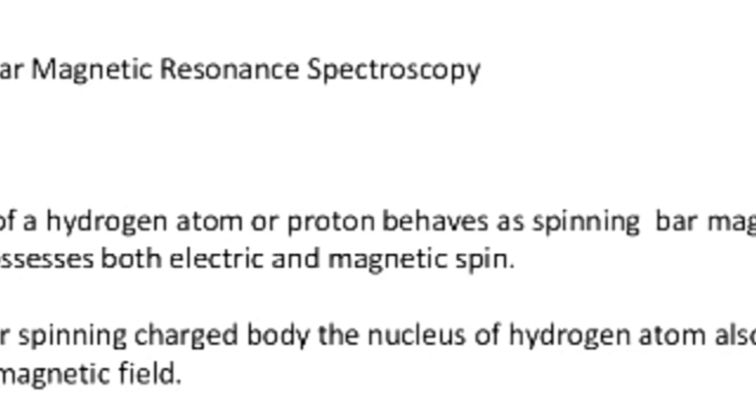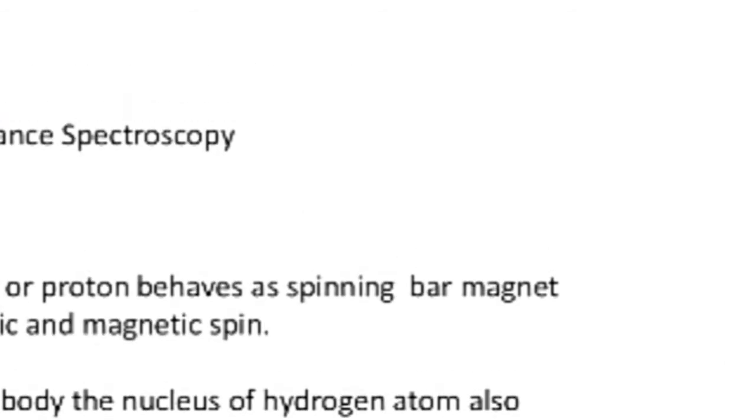Like any other spinning charged body, the nucleus of hydrogen atom also generates a magnetic field.